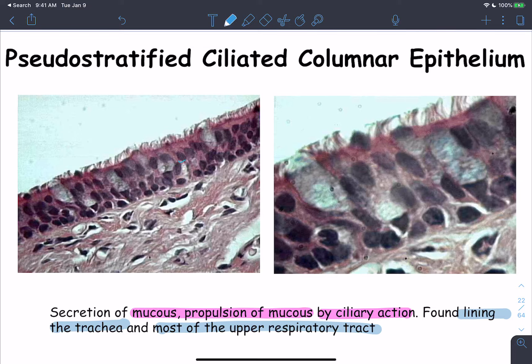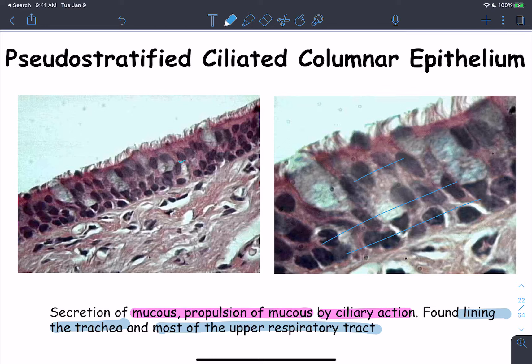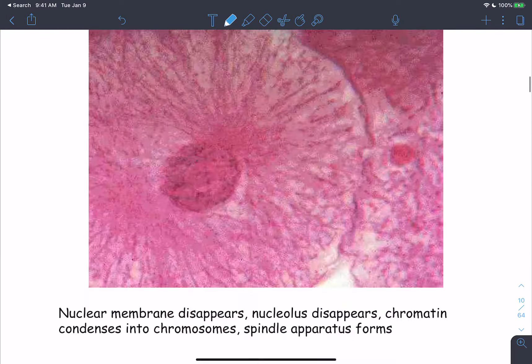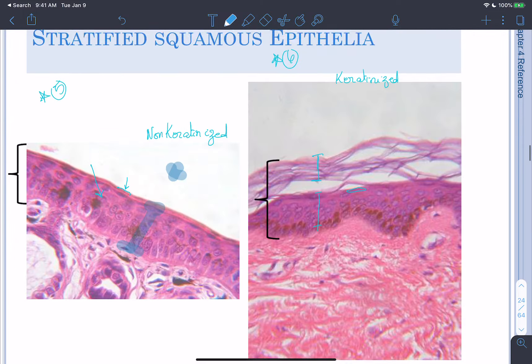Another type of epithelial tissue we've been discussing is the pseudostratified columnar ciliated epithelium. This is the type of epithelium that gives the impression of more than one cell layer because of the arrangement of the nuclei. It appears stratified, but when you look at the shape of the apical cells, you find they are columnar — and it's not logical to have a columnar cell at the apex of an epithelial tissue.